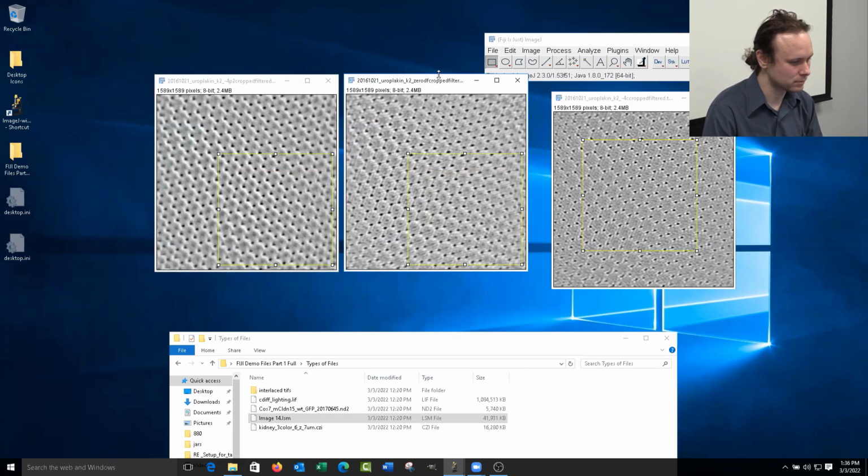And then with that, if you were to use this as a way to do the inlet, would the new image you created do the expansion of the scale bar to show the difference? Or is that something that you would have to do, that would take more work, if that makes sense? So we haven't got to the scale bar yet, but FIJI will handle scaling information entirely for you if it already exists. So you don't need to worry about it. Images will always have the correct scaling regardless of what you've done to them, as long as it's there to begin with. These images don't have any scale information right now, but I think that's the next part. So we'll go over that.